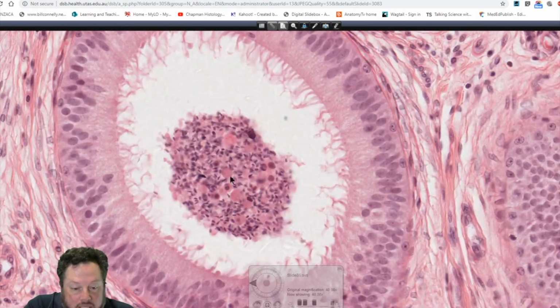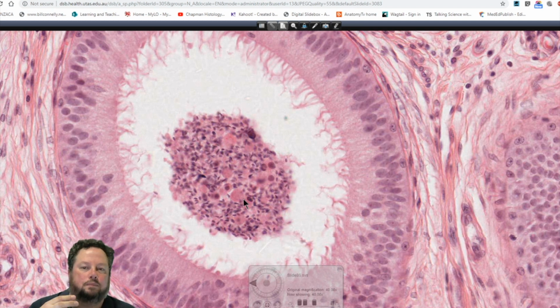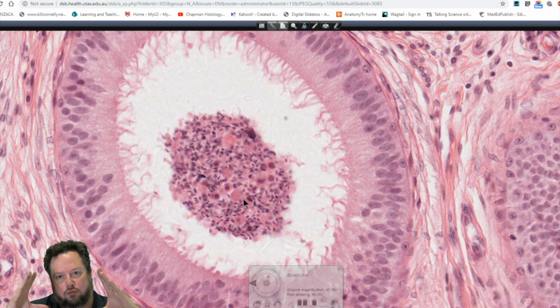So you can see some of the sperm here. They're all quite highly concentrated. We've got some other epithelial cells out here. Some of these would also be some of the residual bodies. You know, when the sperm undergo spermatogenesis, they transform from that big round cell to eventually the small spermatozoon shape. As they do, there's a little bit of excess cytoplasm.